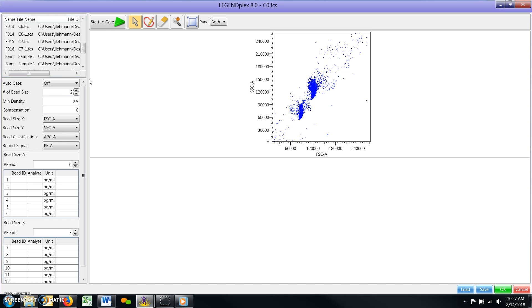Number of Bead Size. The default setting for this parameter is 2, as the majority of the LegendPlex assays contain two bead sizes, the smaller A beads and the slightly larger B beads. If your particular assay contains only one size bead, please adjust this number to 1.